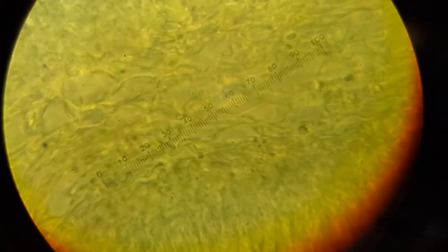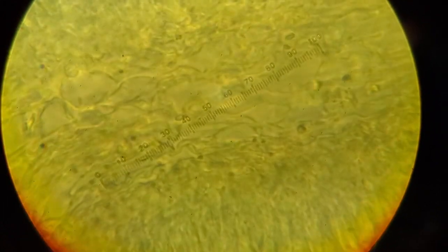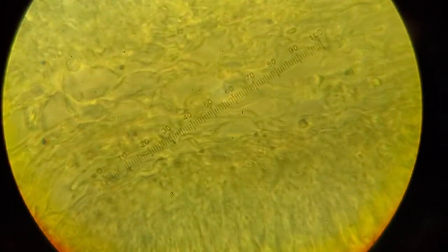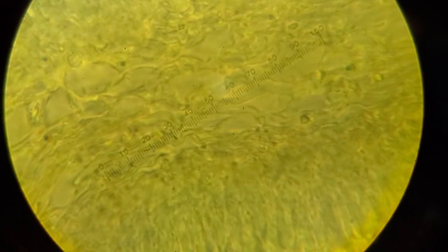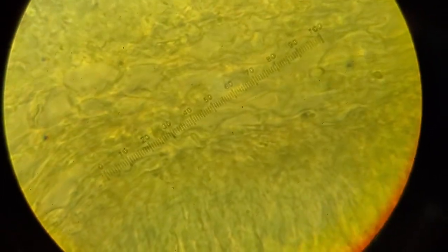With hyphae, it's a little bit harder to look because these are not that rehydrated, not that great. I find that if you have Melzer's, everything rehydrates way better for me personally versus Congo Red and KOH.